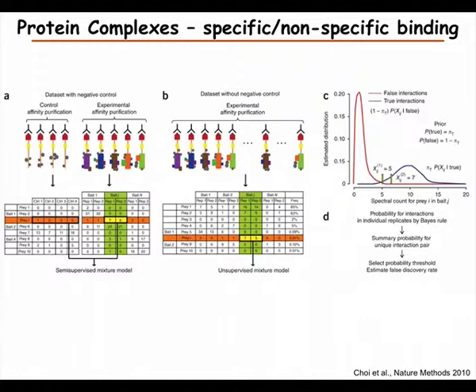So from what I understand, a non-specific interactor would be the same for all IPs. But what if this non-specific interactor is actually an interactor for one IP? Let's say it's abundant in all the IPs, but for one IP it is actually an interactor.